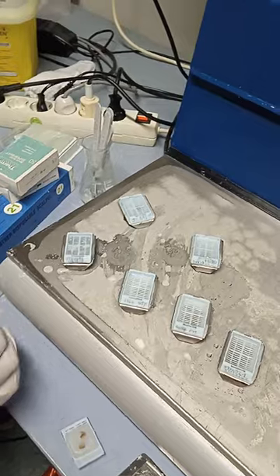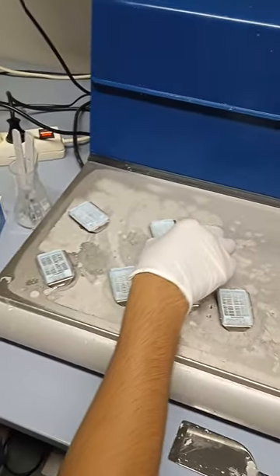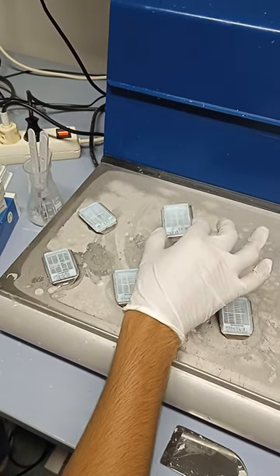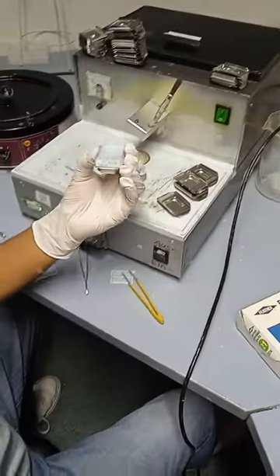Now I will show you another tissue which we have already embedded with paraffin and placed on the cooling machine. I'll show you how to remove it from this steel metal container.